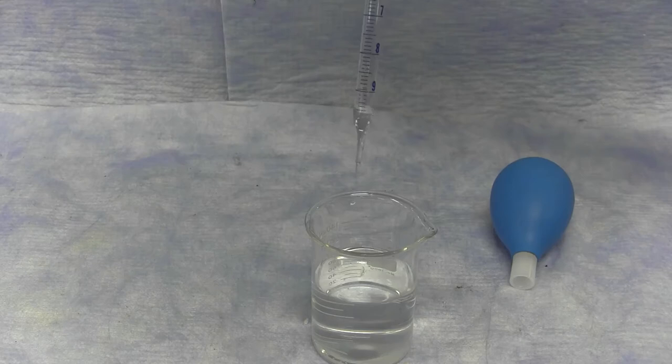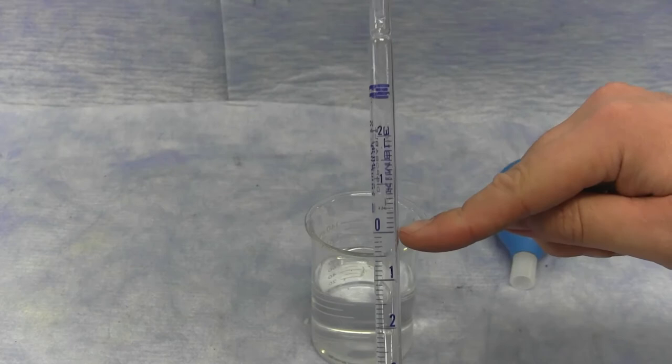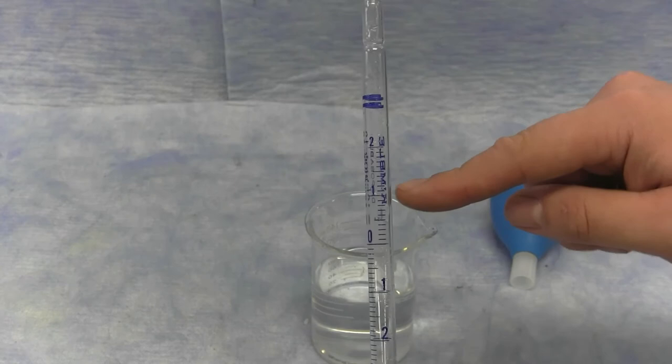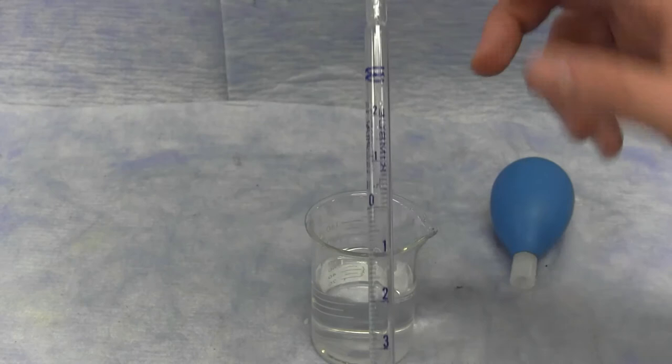Many times when using the pipettes, you'll notice that they go above the zero mark to the negative one or sometimes the negative two mark. You can draw the liquid all the way up past the zero mark to any of these points and use that as your initial volume reading of the pipette. As with a burette, the volume dispensed is the final reading minus the initial reading.